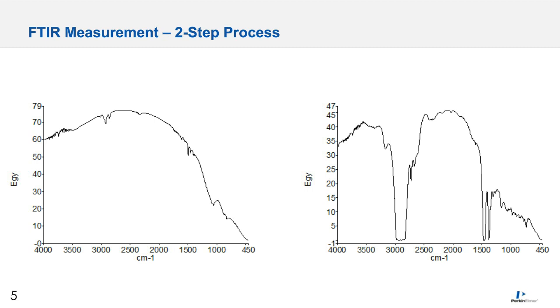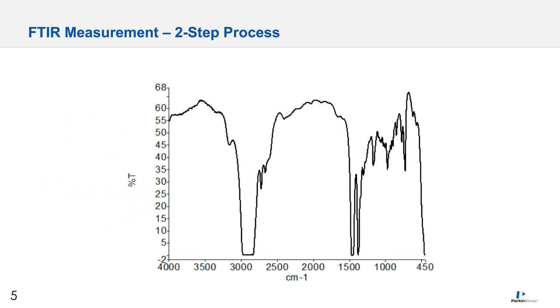The second step is the measurement, the very same measurement, except performed in the presence of the sample. So in this situation, with this analogy presented before you here, this is a measurement of a mineral spirit sample within a liquid cell. So at the right-hand side, you see that that intensity spectrum is very different, that there is now loss of light at certain frequencies, which are ultimately those spectral bands similar to what we observed in the previous spectrum. These two pieces of data are then ratioed. So that sample single beam spectrum is divided by the background single beam spectrum to present us with what we call a transmittance spectrum.